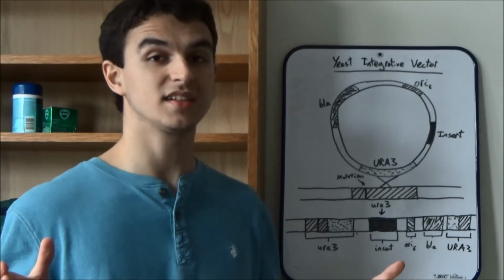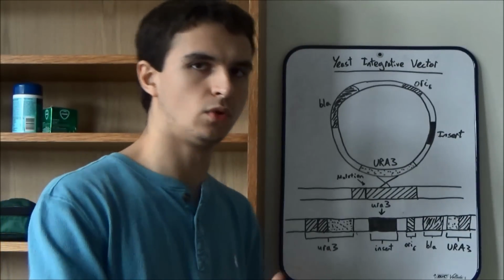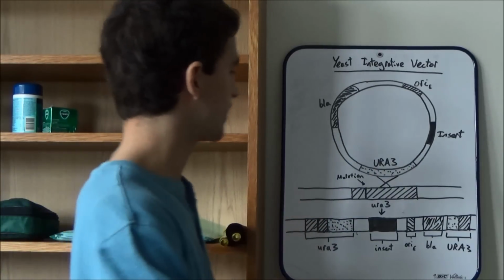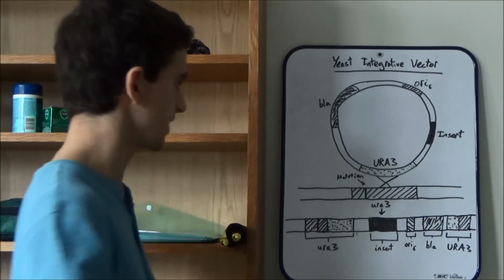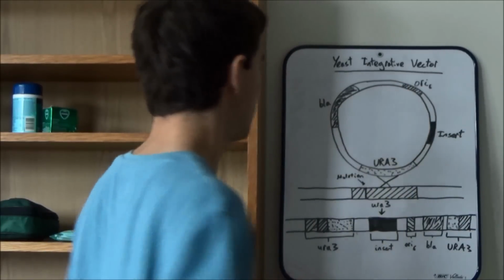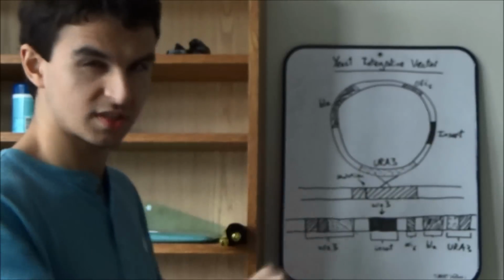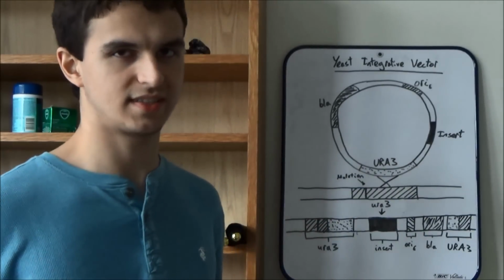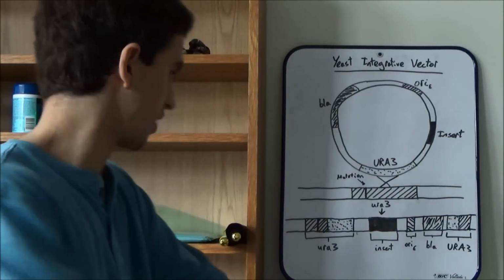Now, in the olden days, we used to degrade the chitinous cell wall of the yeast cells, but now somebody found out that if we mix the yeast cells with lithium salts, in particular lithium acetate, then that will create pores in the yeast cell membrane, which allows this plasmid to be pushed in. Once the plasmid is inside the cell and inside the nucleus, that's when the exciting stuff happens, because this is when this plasmid gets integrated onto the chromosome.